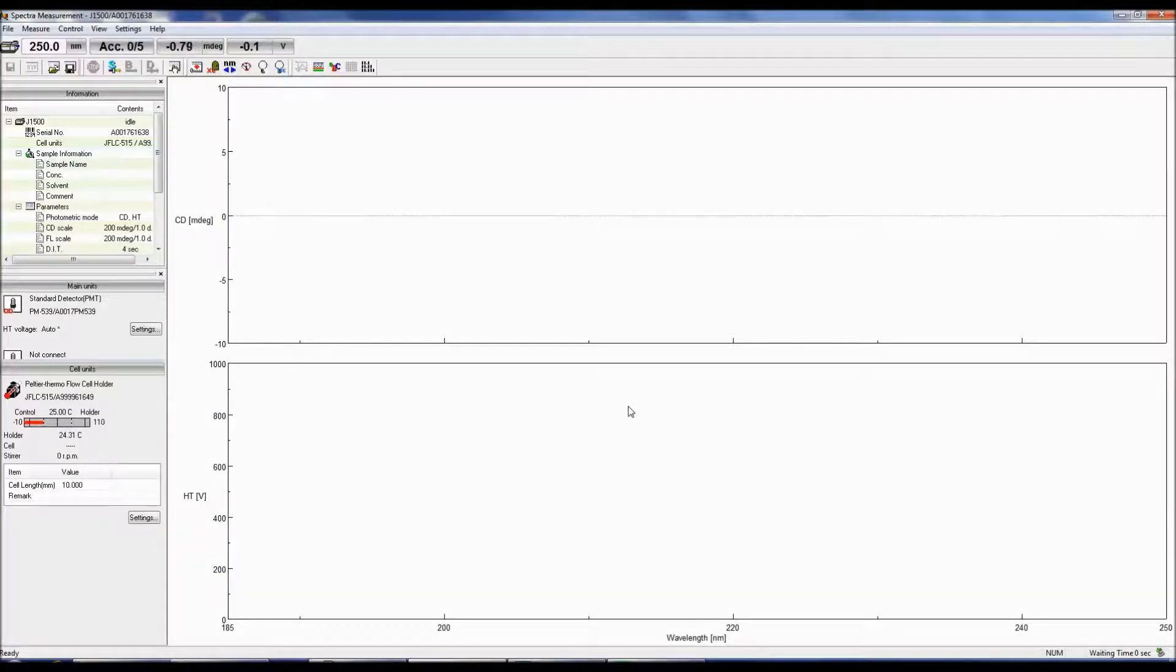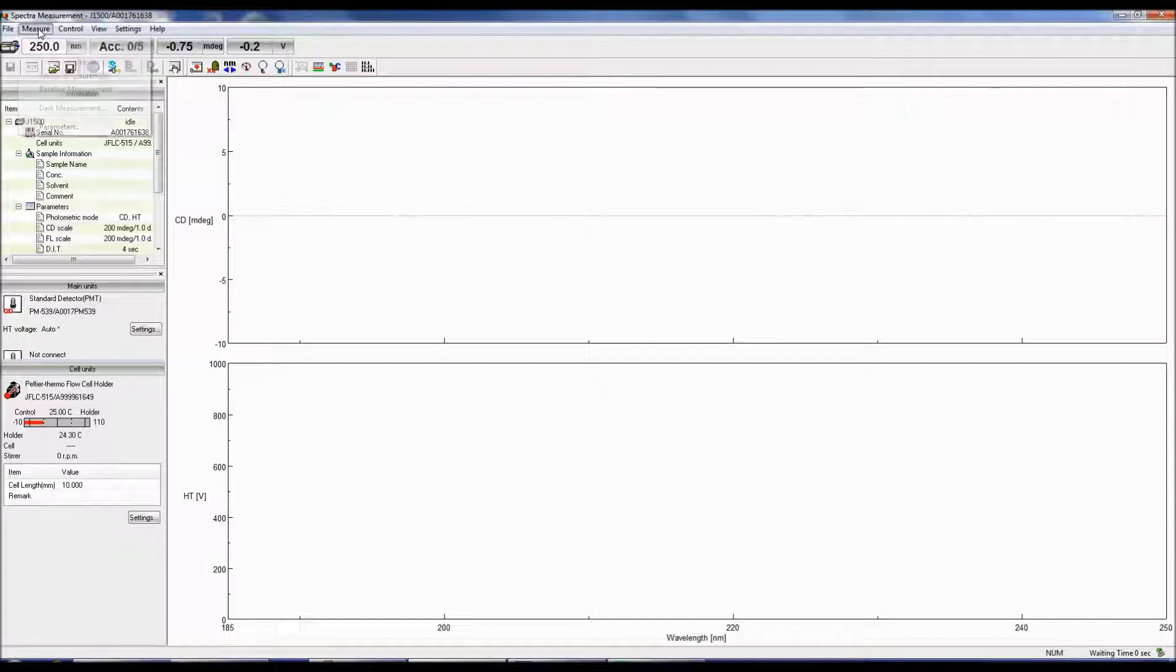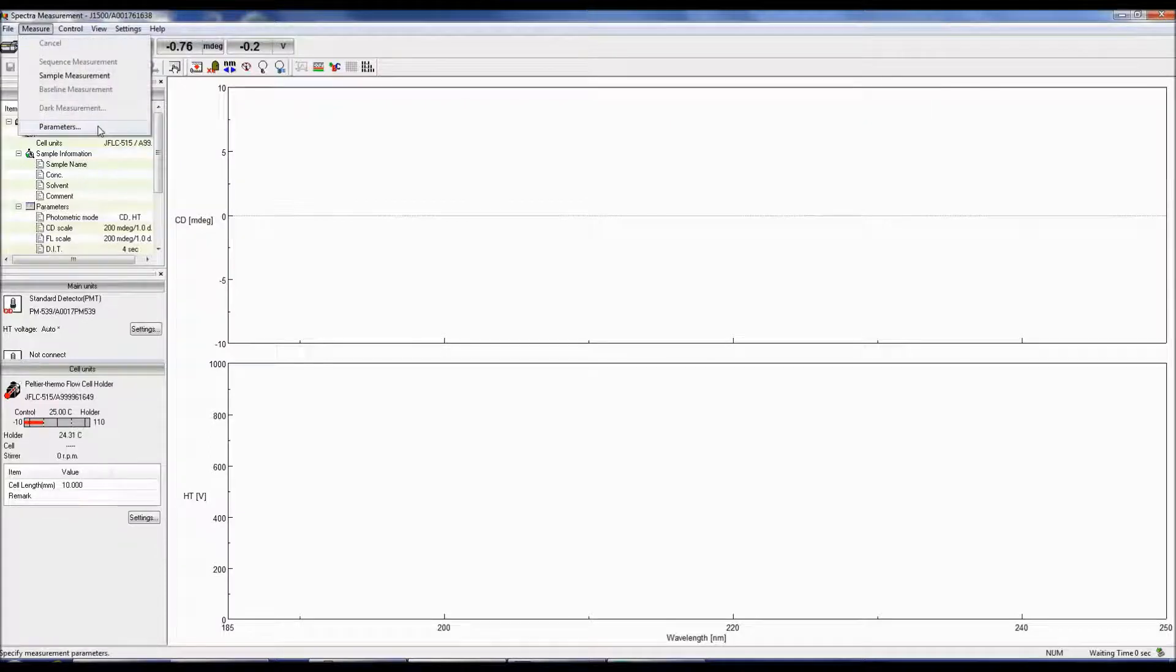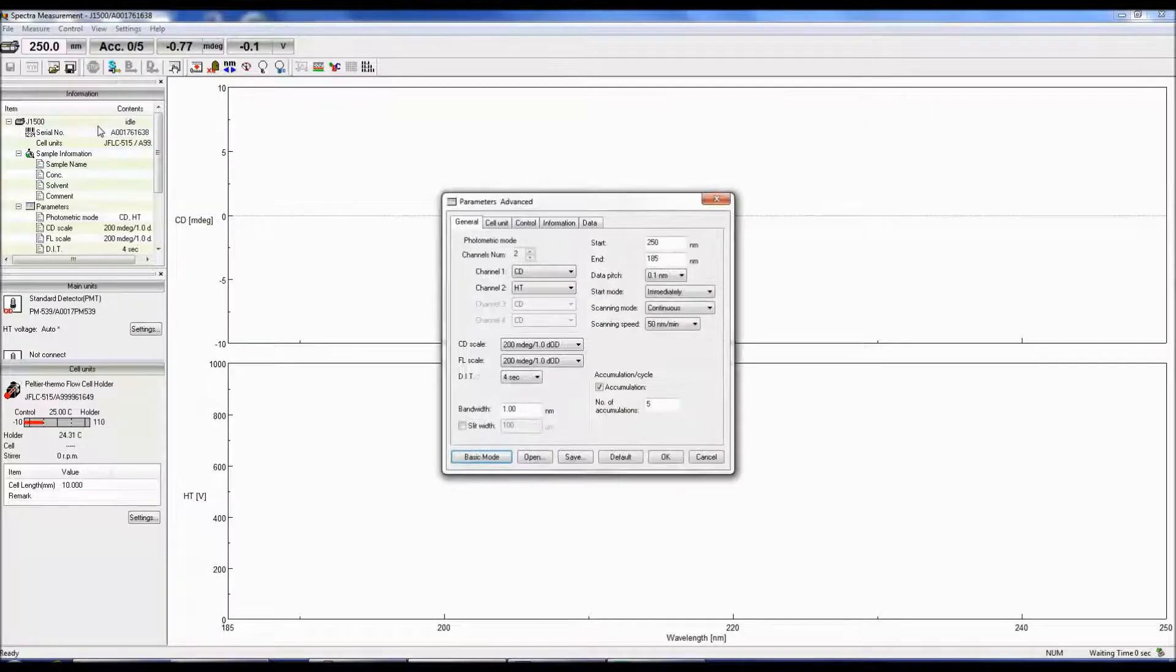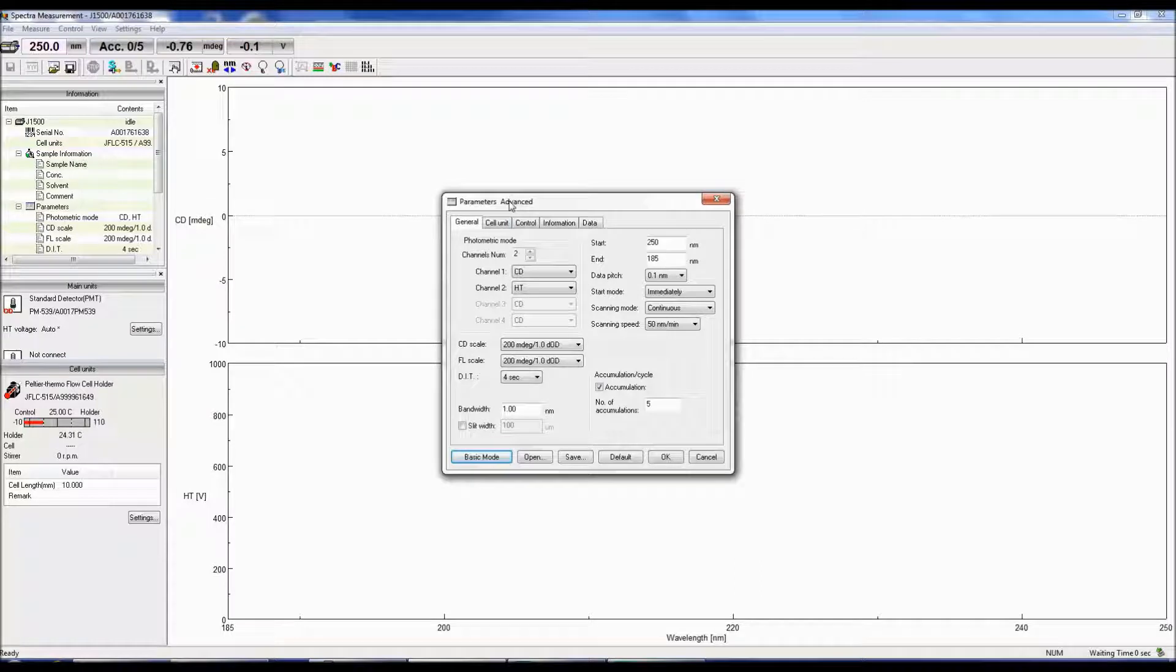To specify your parameters prior to obtaining a CD spectrum, you can either click the Parameters icon or go to Measure, Parameters. The Parameter menu box will now pop up and the first tab selected will be General.